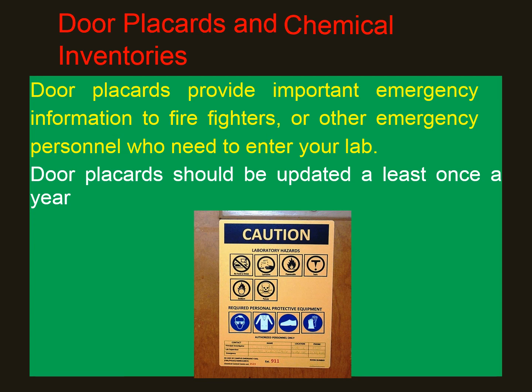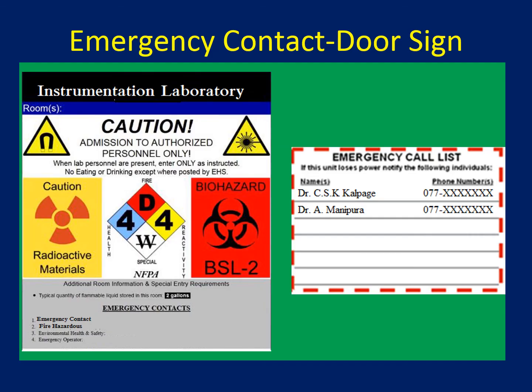Unfortunately, when I went to pay at the supermarket, it was not working. I said it was working in the early morning, and they said no, it is not working because during that time I had entered this NMR lab, so my credit card was destroyed by this magnetic field. So emergency contact numbers are displayed on the door.